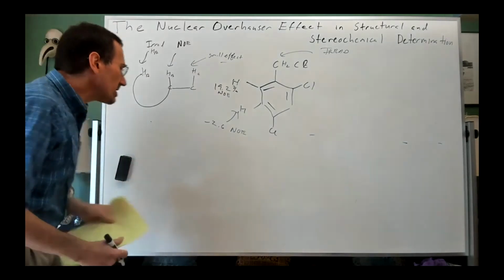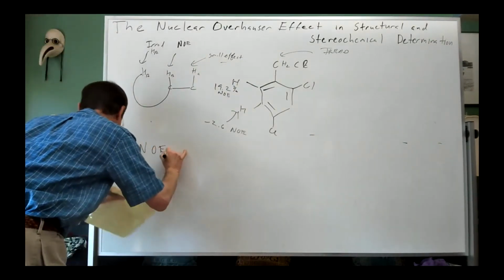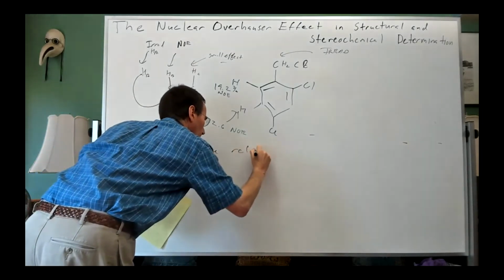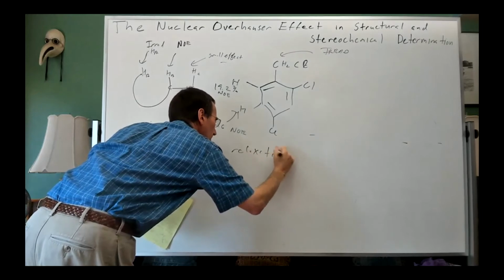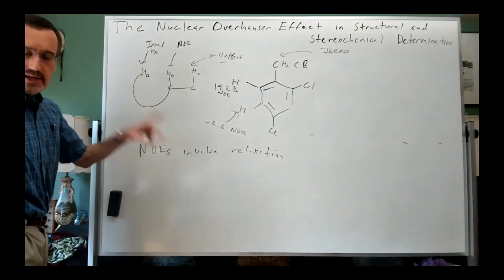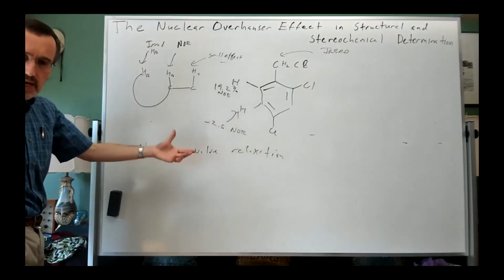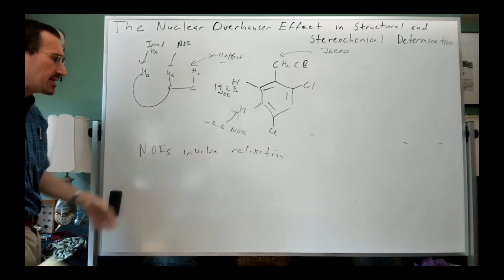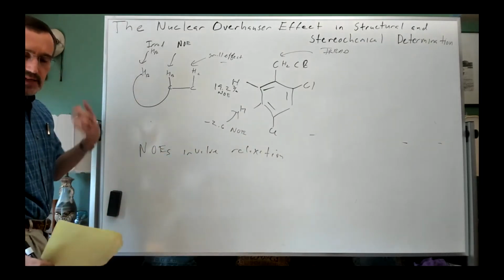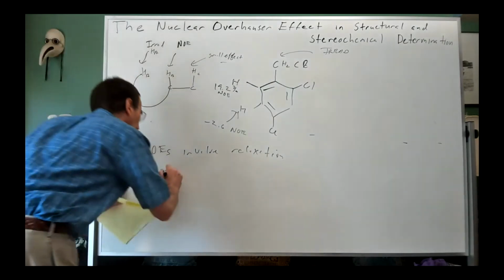Now, NOEs work by relaxation. Which means you often have to have an irradiation period that's reasonably long on the time scale of relaxation. So your irradiation needs to typically be for hundreds of milliseconds or even for seconds.